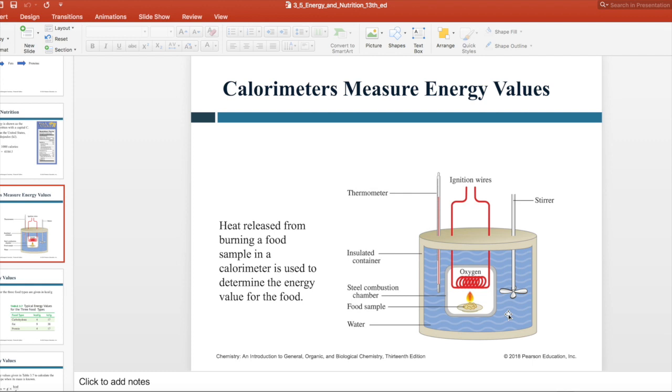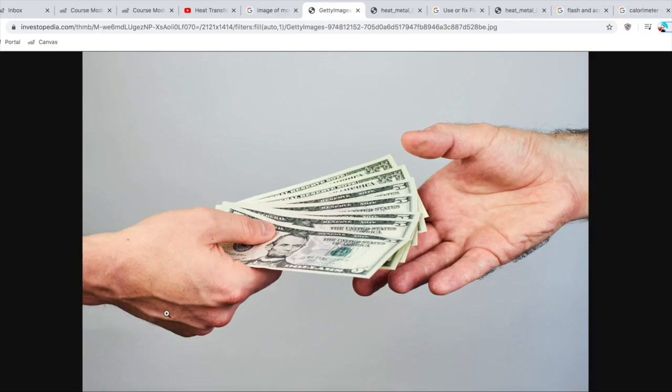There's a conservation there. That means those two values are equal. You can think of it like this: this person is giving $27, and this person has gained $27. This is called a transfer of money, and heat is the same way. If one loses 27 joules, then the other gained 27 joules. There's a conservation there. So keep all that in mind as we do this experiment.